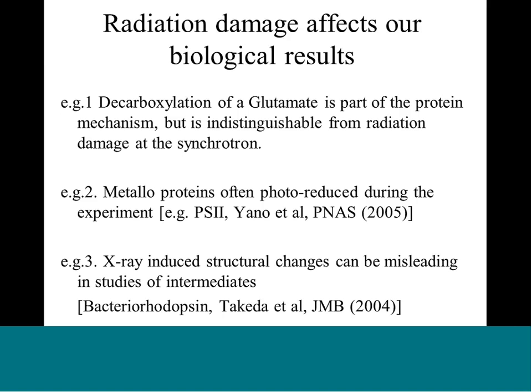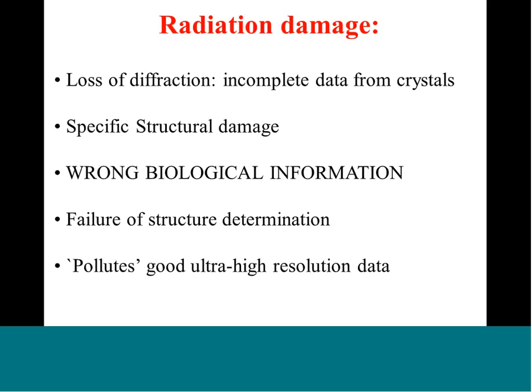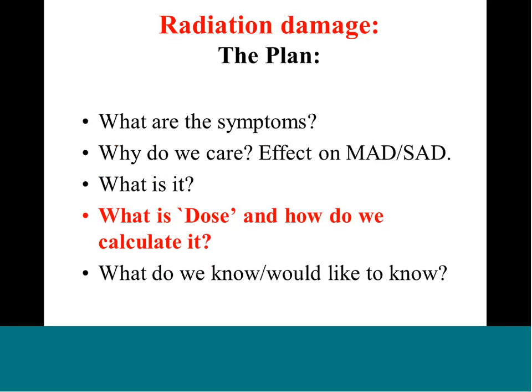In summary, what we see is a loss of diffraction, specific structural damage, we can end up with the wrong biological information, and our structure determination can fail. A few radiation-damaged images can really pollute the electron density map.